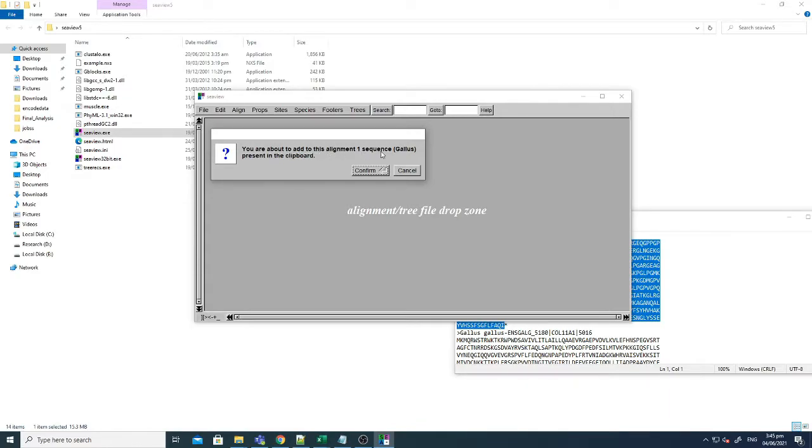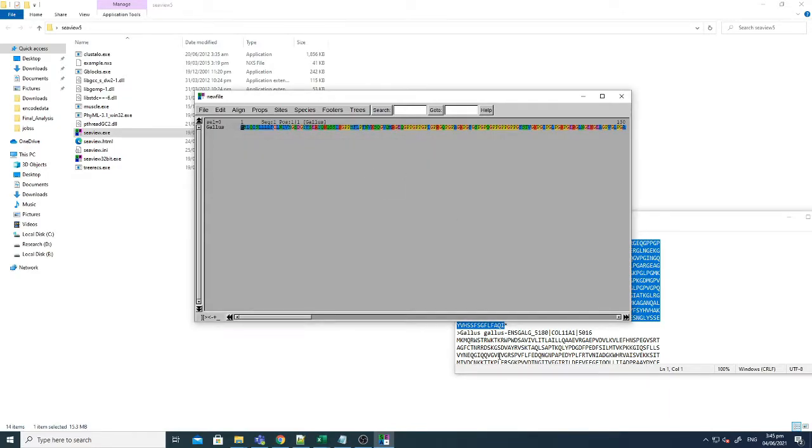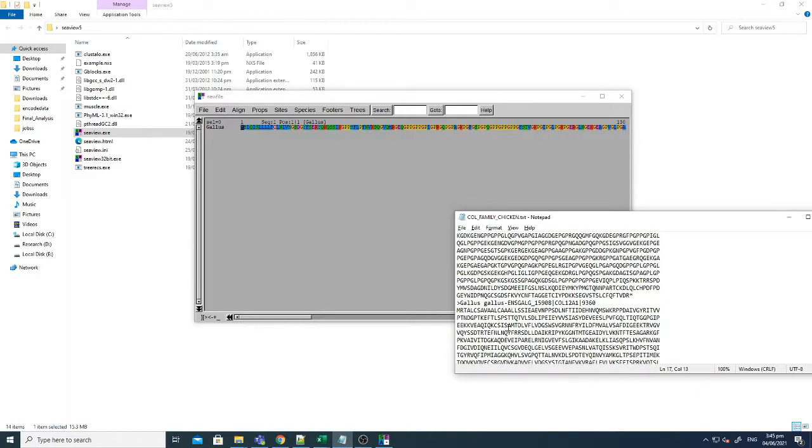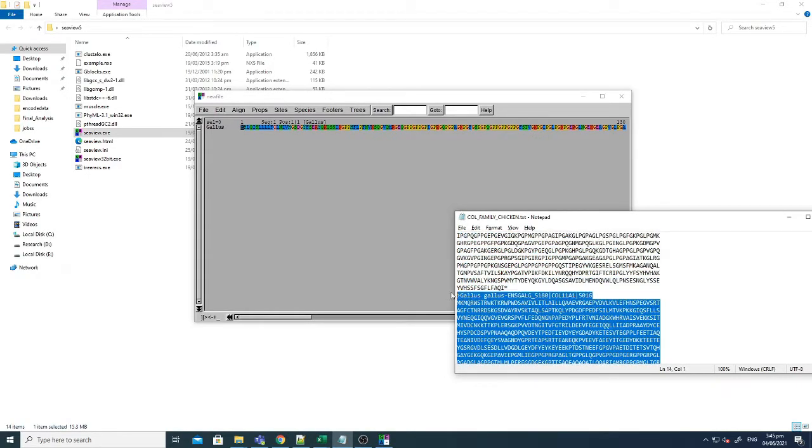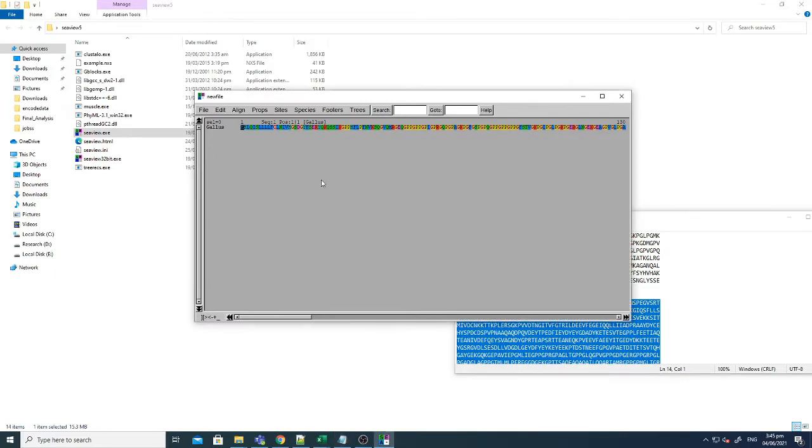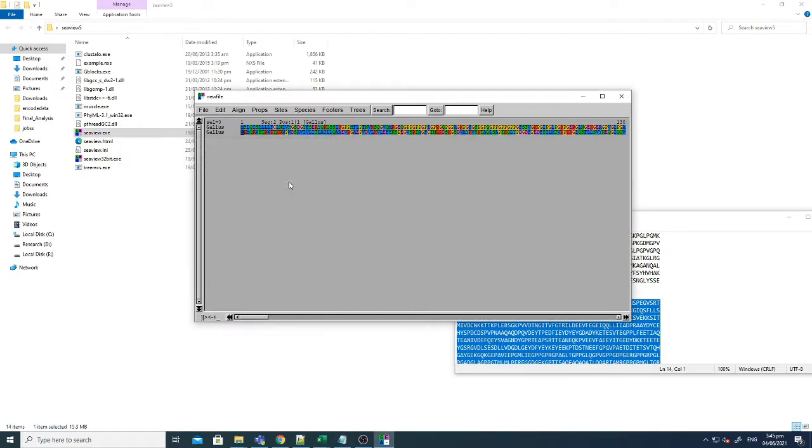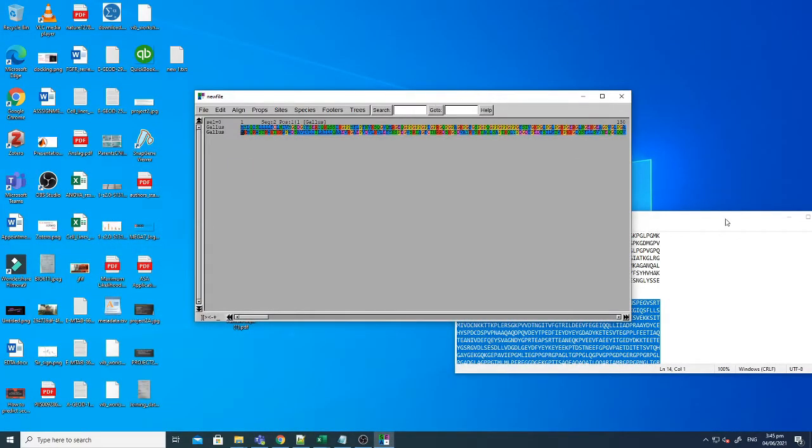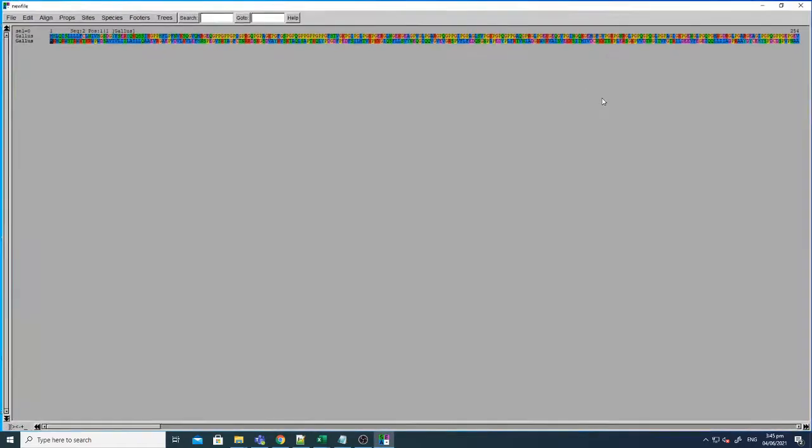And it's saying you are about to add this alignment, one sequence of gallus. I said confirm yes. Right, now I want to add more sequences. For instance this one, just copy it, just paste it and it's again saying one sequence. Now I have two sequences here. I just take the example of two sequences because it will be easy for you to understand.